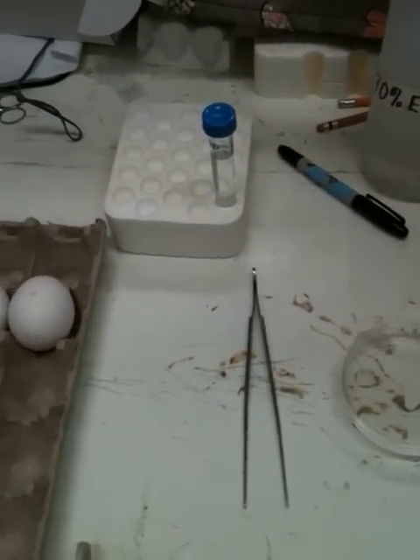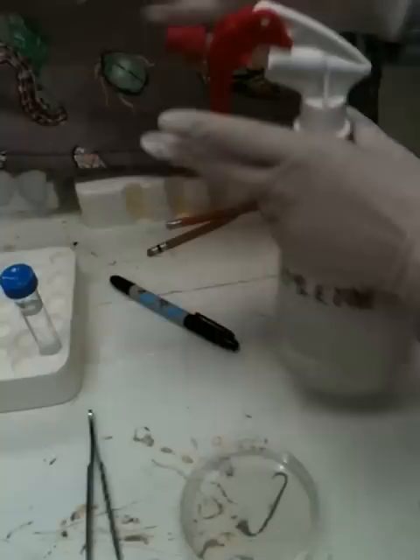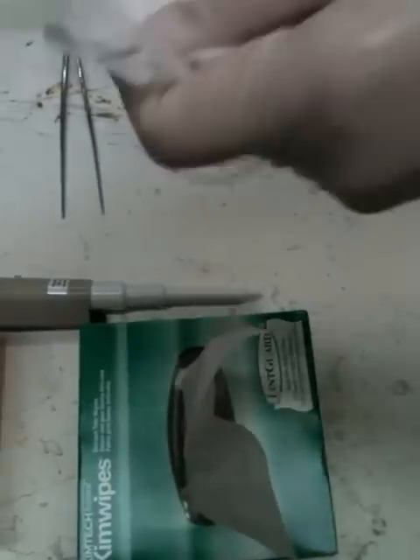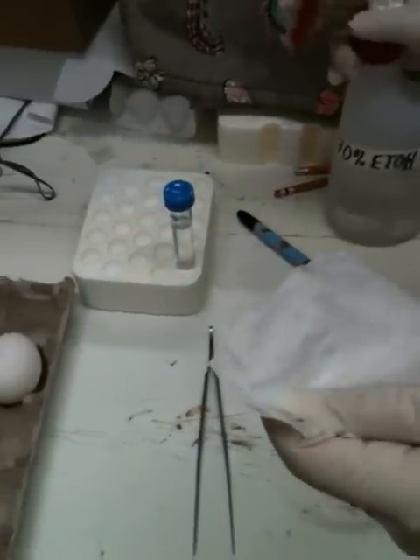First, sterilize your hands with 70% ethanol, spray a little bit of ethanol on kimwipes, and wipe the eggshell.